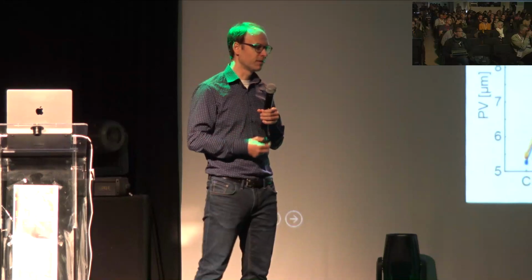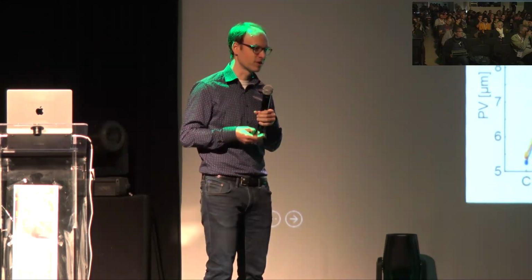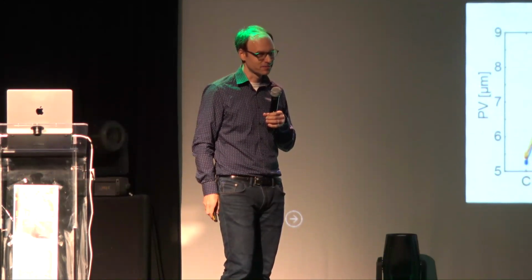Well, the problem is still that we have a scanning microscope, right? And so the frame rates are on the order of just a few hertz. So in that sense, voltage imaging would be very challenging.